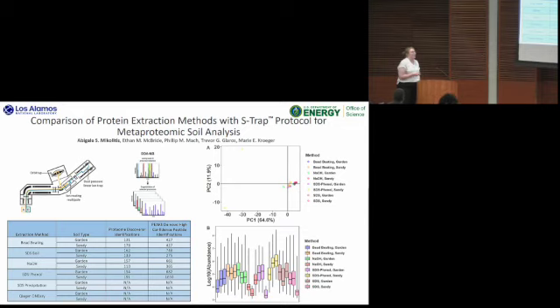In our Proteome Discoverer identifications, we had 205 total proteins identified. All of these counts are very similar, with some variation. We used 3 FASTA files for each soil type, our garden and sandy. Sorry, I meant to cover that earlier.